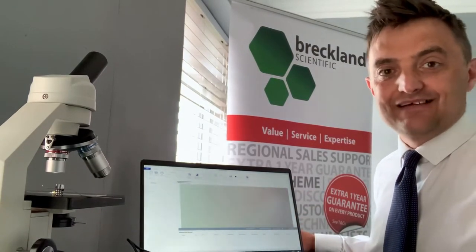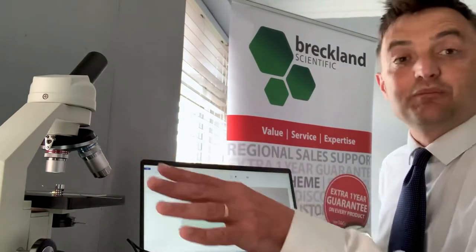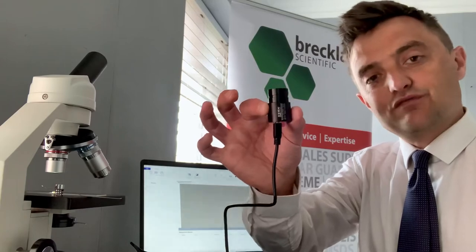I love any excuse to get out pond dipping, so that's what I've done this afternoon. I've been out, got a sample of water, made up a slide, and I thought what a great opportunity to show you the new microscope eyepiece camera from Kern.